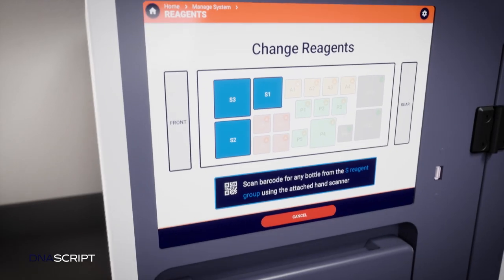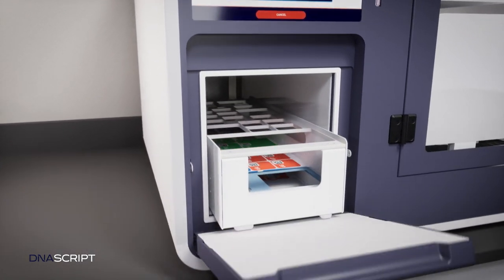Next, prepare the Syntax system by loading the reagents provided in a Syntax synthesis kit.